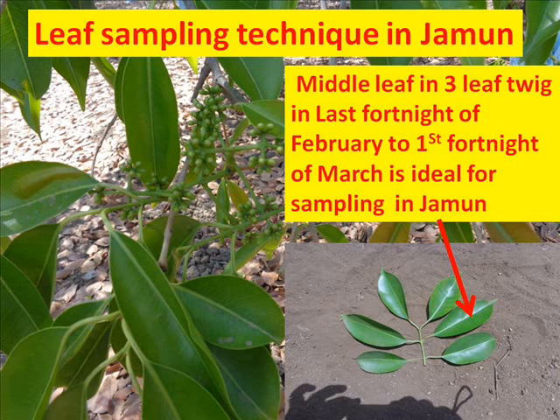That is the stage at which we get the most recently matured leaf.